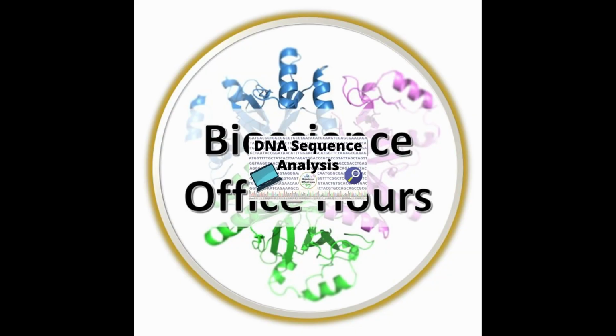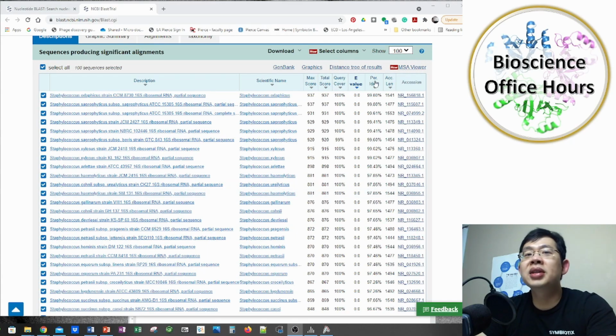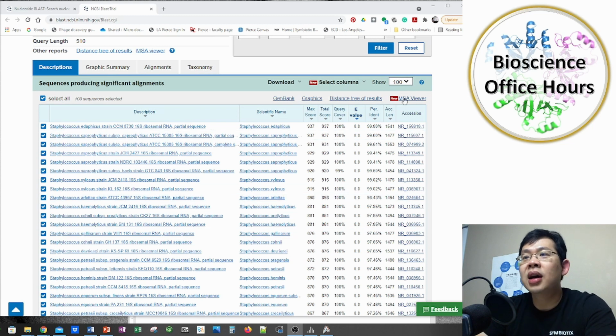All right, welcome back to the lecture series in bioinformatics and DNA sequence analysis. In parts 1, 2, and 3, I took you through the experimental workflow from the colony PCR, running the gel, sending it to DNA sequencing, and then looking at the sequence file by downloading it, looking at the trace file, and doing the sequence alignment using BLAST. So you have this result from part 3. Now let's take a look.